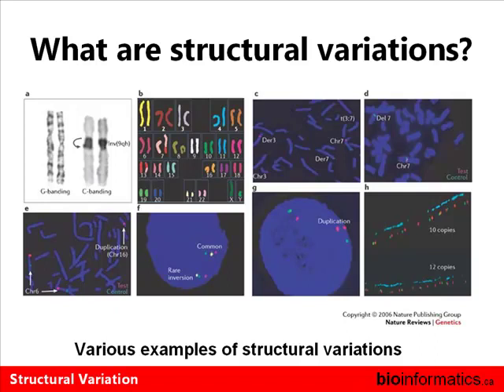Basically, to me, structural variations are anything which you can't find just by mapping a read. So you take a read, you map it, you can find a SNP. You can find a 2-base pair insertion, 4-base pair insertion. But if you're dealing with a read of length 30, you can't find a 10-base pair insertion, just because the read will have tons of locations where the two parts are spanned by a 10-base pair gap. Just the statistics are against you.